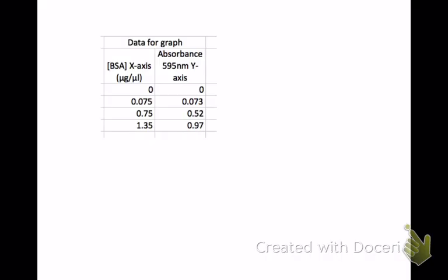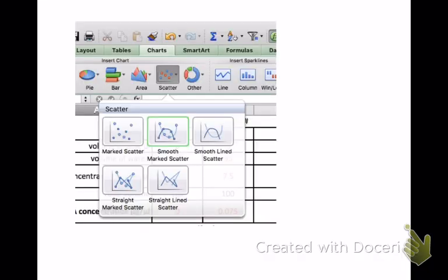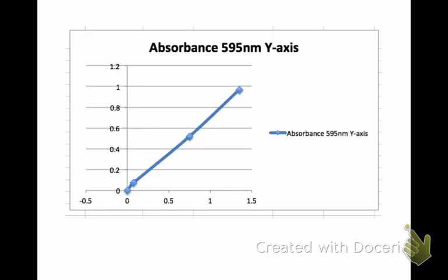I'm labeling BSA as my x-axis in micrograms per microliter, and the absorbance at 595 will be my y-axis. I do this typically in a program like Excel, but there are certainly other spreadsheets you can use — you can even use Google Docs. We're going to select these columns, go up to the menu, and pick a scatter chart — specifically the smooth marked scatter — and as soon as I release that we will get this graph.